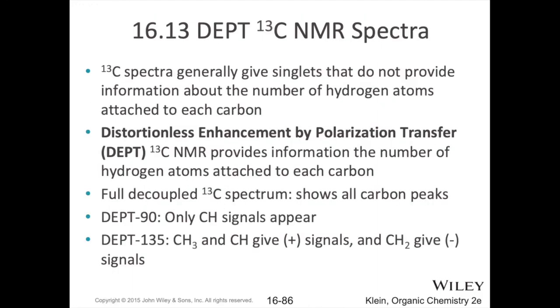All right. So again, you're kind of limited a little bit when you do your carbon-13 NMR. You can still get a lot of useful information, but due to the decoupling there, you don't get any splitting patterns. So it doesn't tell you a lot about the hydrogens connected there. That being said, it is possible to do what we call a DEPT carbon-13 NMR, which stands for distortionless enhancement by polarization transfer.